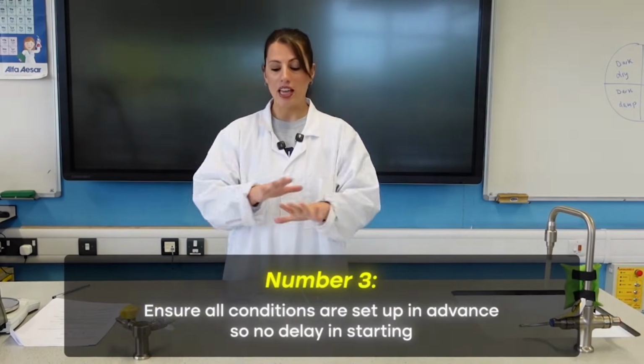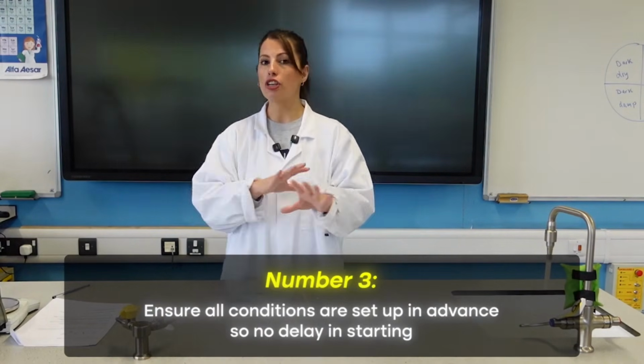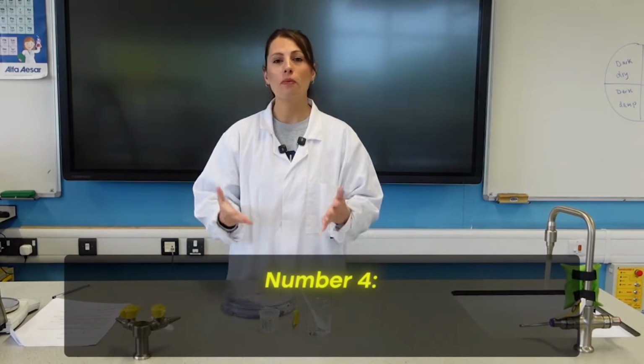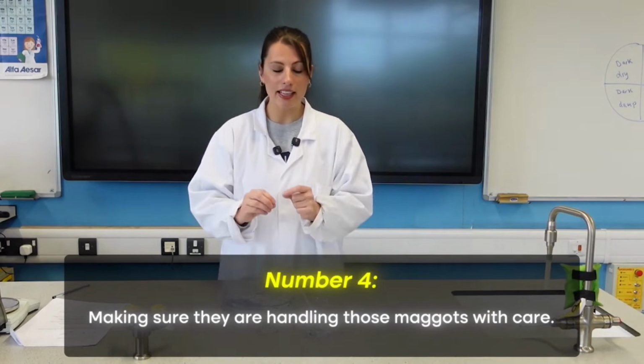Number 3 is making sure that everything is set up in the choice chamber and ready to go before they add their maggots to the centre, so that there's no delay in adding the maggots, and therefore you can start straight away. Number 4, making sure they are handling those maggots with care, not causing any harm, and working quickly to make sure they collect any that might escape.